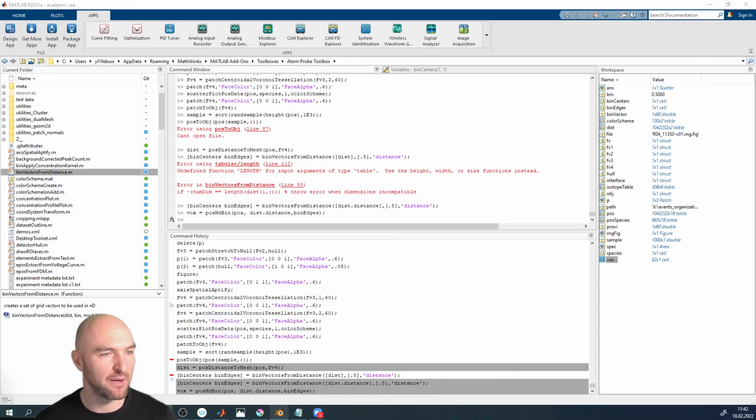And one thing I would really like to do in the near future, I've been talking about that for a year now, is, for example, take the deconvolution function that Andy London has in his Atom Probe Lab suite, where you can do deconvolution. So if you have mass spectrum overlaps, you could take that concentration function, chuck it into the analysis here, and then have everything deconvoluted. And I think this would be very, very helpful for a lot of Atom Probe projects.